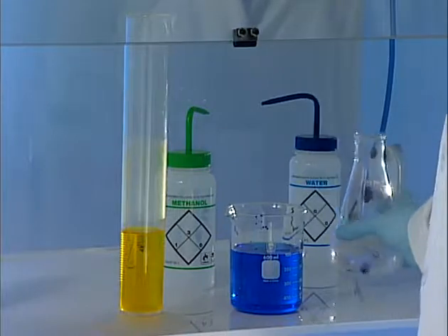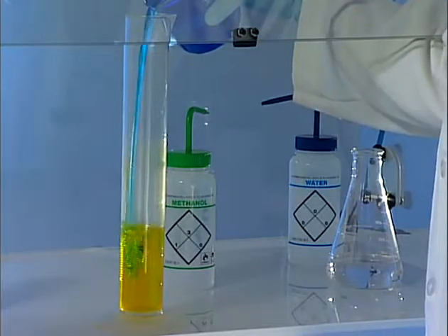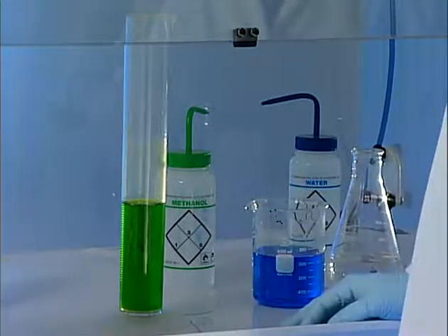TeachAid ductless classroom demonstration workstation is the final piece of the puzzle for hands-on science demonstrations in today's and tomorrow's science classroom. AirClean Systems hopes you found this presentation informative and useful in your search for the correct safety enclosure to meet your personal protection requirements. My colleagues and I look forward to discussing TeachAid and your specific containment needs. AirClean Systems appreciates your interest in TeachAid and our company.